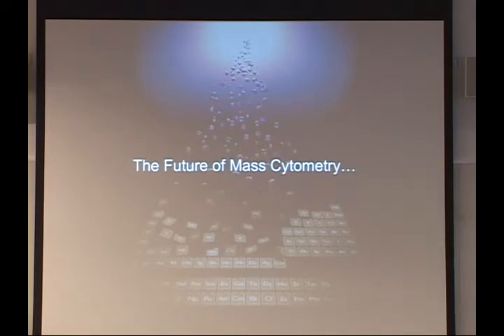So the future of mass cytometry: today and tomorrow, people are going to talk to you about multiplexing samples and drug screening, and how we're able to run experiments on this machine where you can generate 20,000 data points per tube.